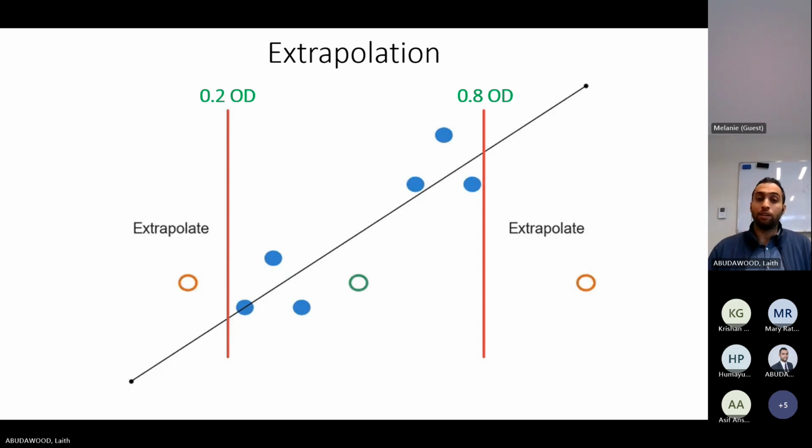However, I can do something that will allow me to extend my calibration curve outside of my actual calibration runs. This thing is called extrapolation.